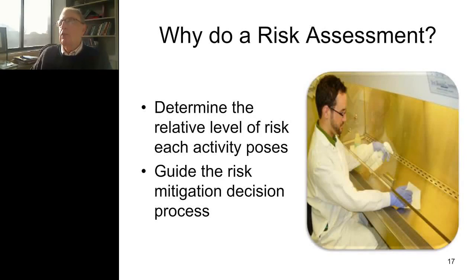So I'm asking here the question, why do a risk assessment? So you want to determine the relative level of risk that each activity that you're performing in the laboratory poses to the staff performing that activity. And then this guides the risk mitigation decision process.